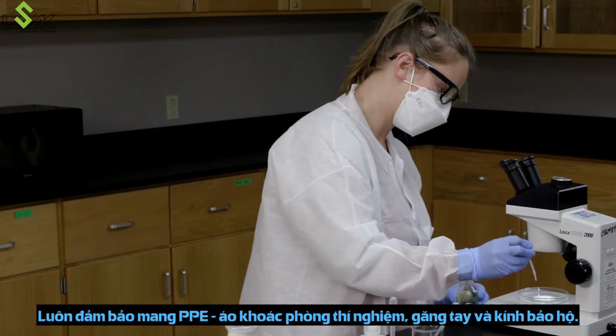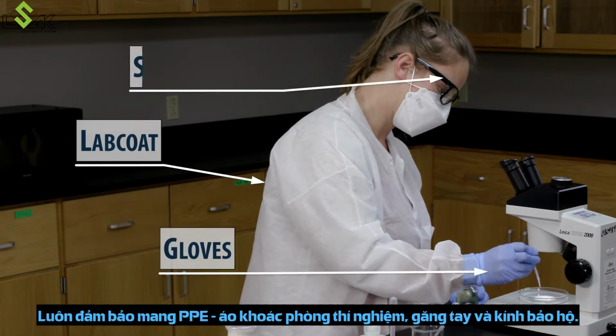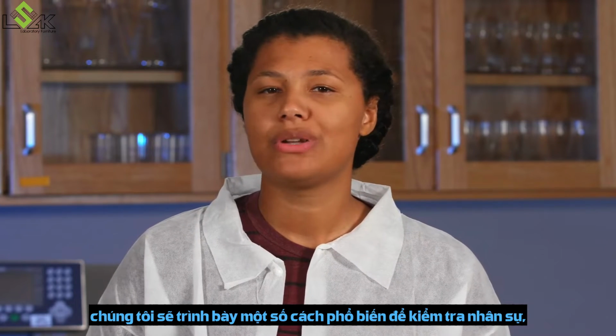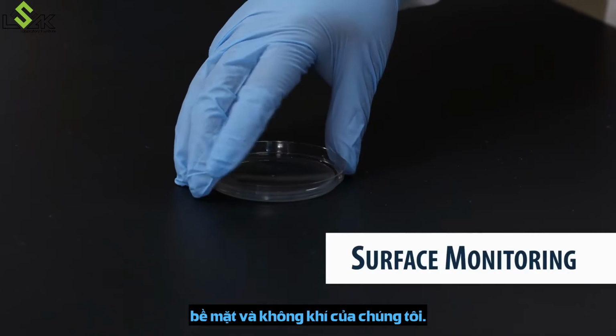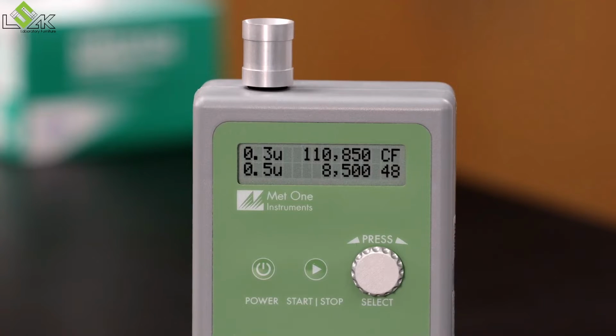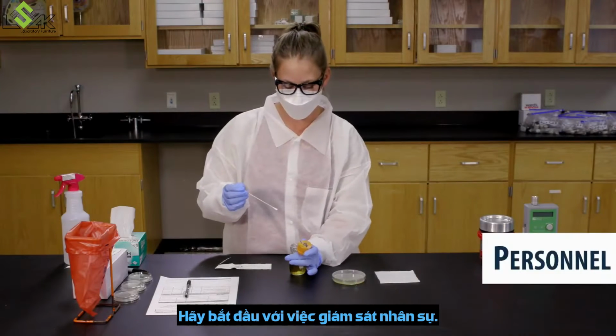Always make sure to wear your PPE, lab coat, gloves, and safety glasses. In today's lab, we're going to demonstrate some common ways to test our personnel, surfaces, and the air. Let's start with personnel monitoring.